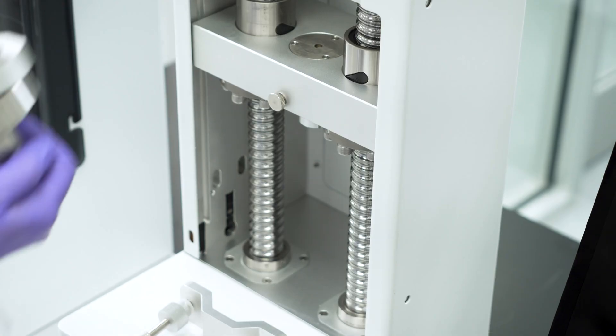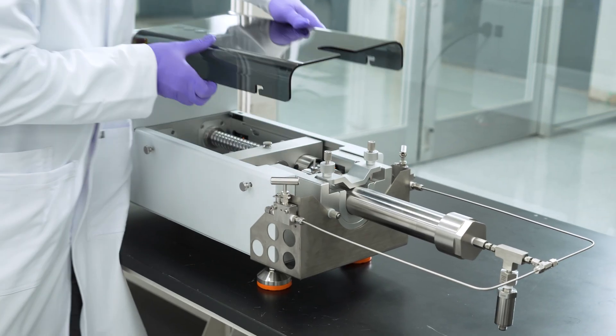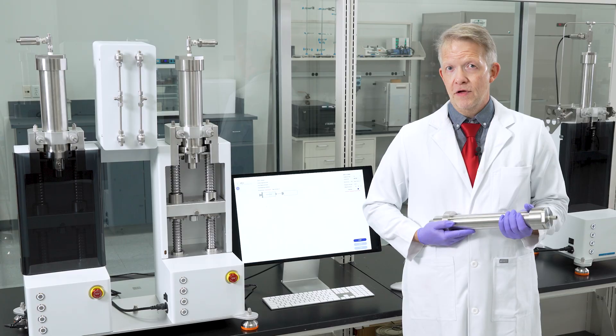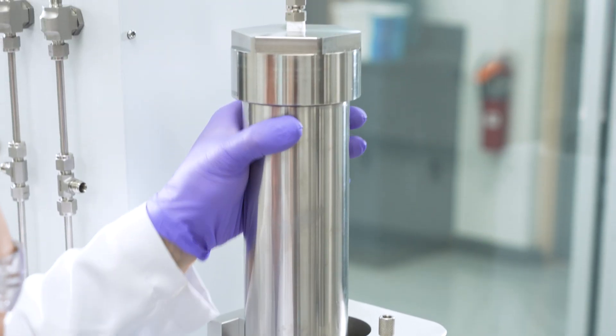Features include easy to remove syringes and the ability to operate in the vertical or horizontal position. Pressure syringes are offered in standard nitronic or Hastelloy C in sizes ranging from 90 ml to 1 liter.